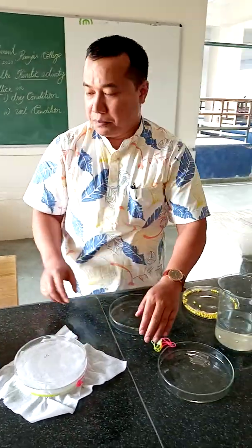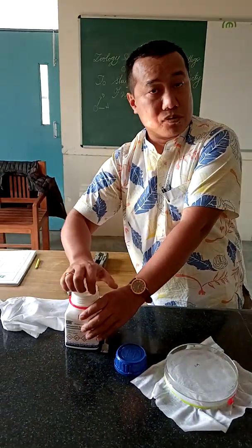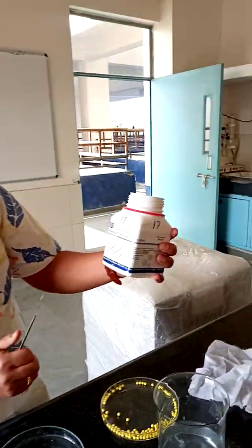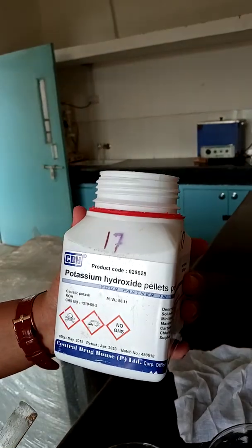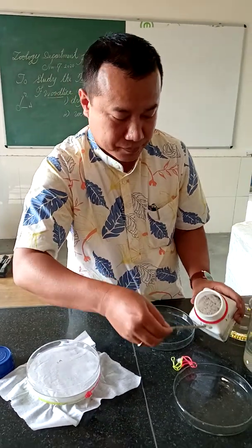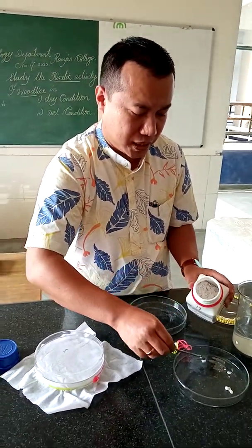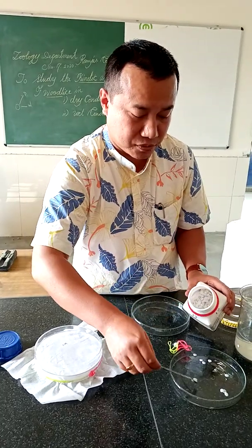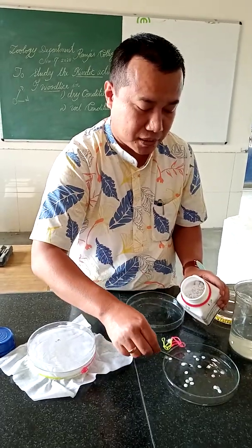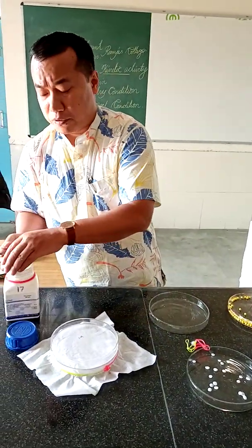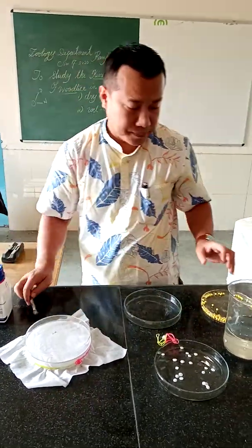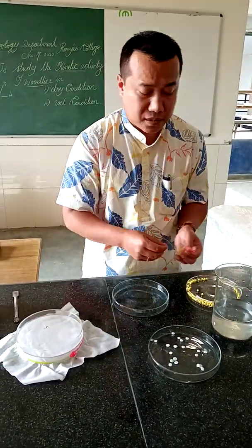For the dry chamber, we will try to make it much drier. We have pellets of potassium hydroxide (KOH) — caustic potash. With the help of a spatula, you can collect around 10 to 20 pellets. When exposing this particular animal to dry conditions, please remember not to keep it there for a long time because it may desiccate the animals. The body is not suited to dry conditions — we know this from theoretical study, and here we are trying to prove it experimentally.